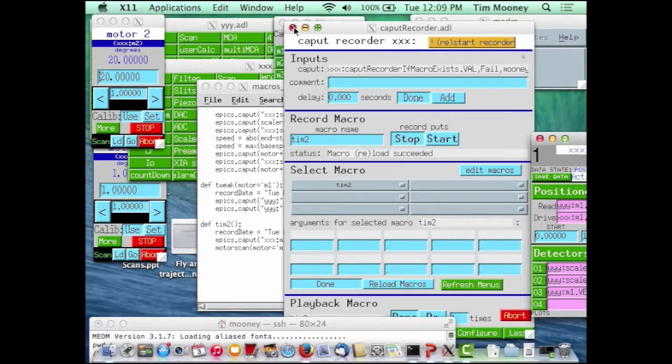I mean, it does depend on the access security file, but the default access security file that I'm recommending to people just does trap right for everything, because we don't really use access security much on the beam lines. Where we run into it is something like a display for the ID. And then you get that circle with the line through it. That circle with a line through it, that's access security telling you that you don't have permission.